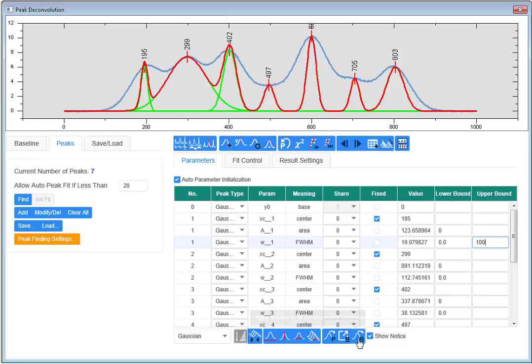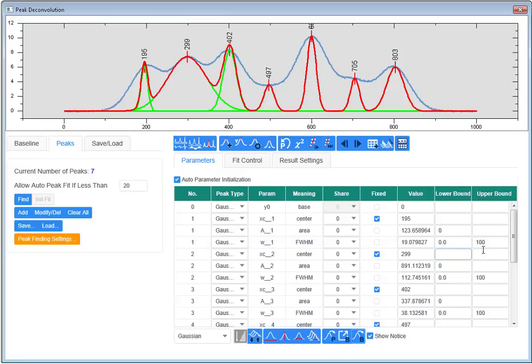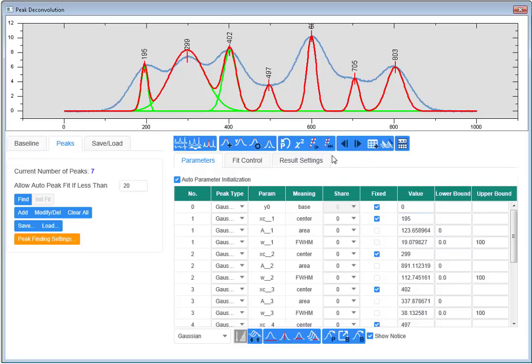I can input a hundred as an upper bound for one of the peaks and then apply the bound to all corresponding parameters by selecting this icon. I would like to make sure that the baseline is fixed to zero.